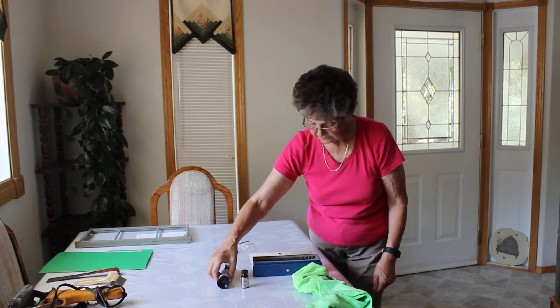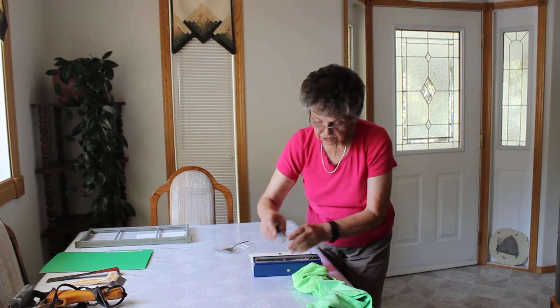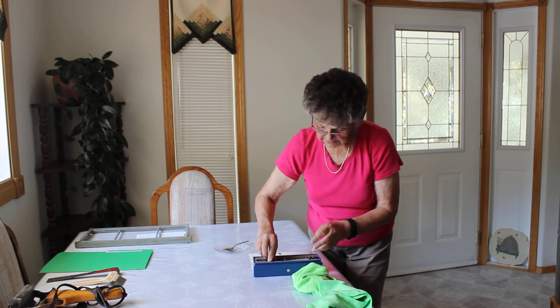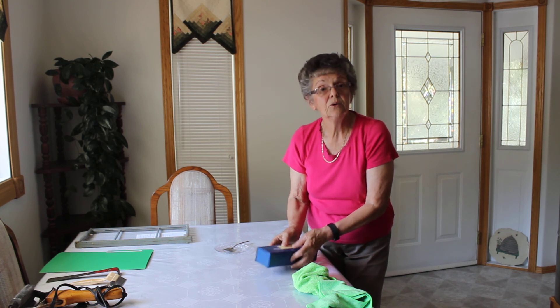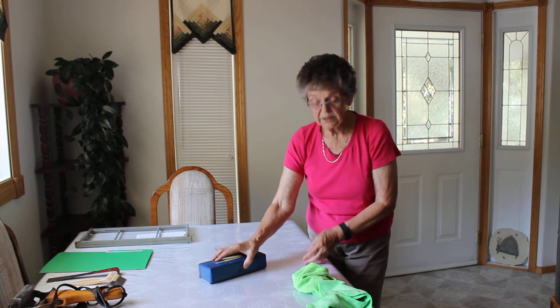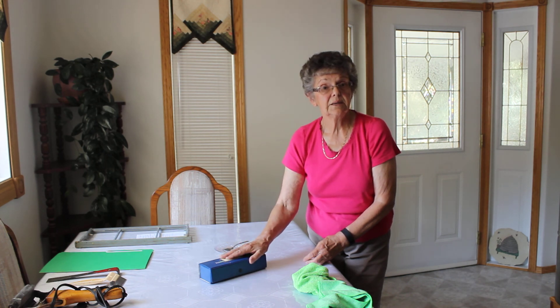Then close it up and put it back in. Make sure this is on tight, lay that in, and close it up and put it away. Or you would put it in the bag and bring it back. Make sure you're very careful with it so that it doesn't get banged.